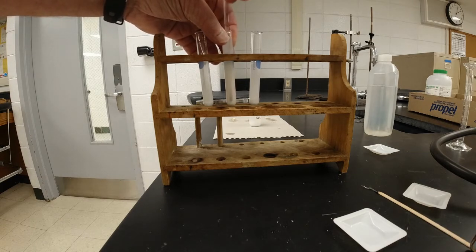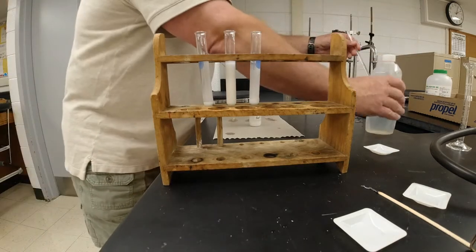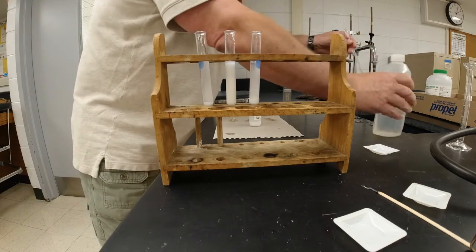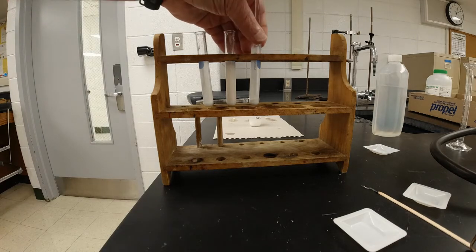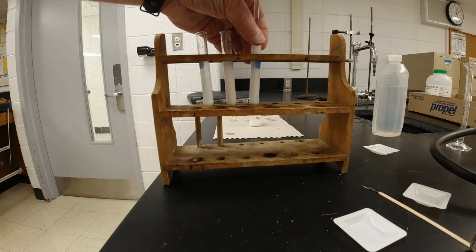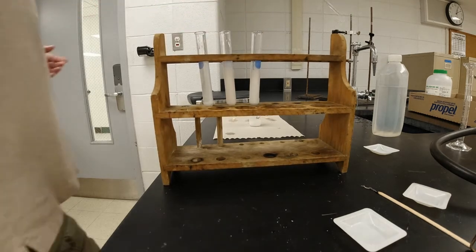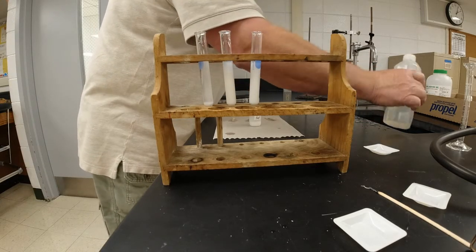This one is the calcium sulfate. And the last one I'm going to stir up is the barium sulfate. And then I'm going to let them sit and settle.